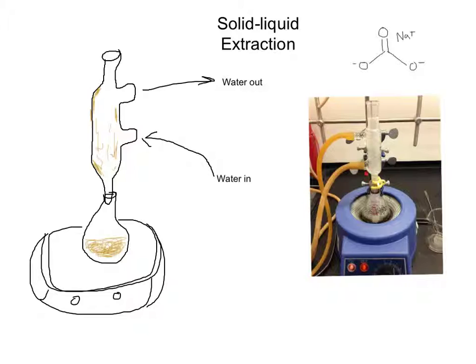After the solution of water and sodium carbonate was added to the tea leaves, the complete solution was heated, which allowed the water to expand the leaves, dissolving caffeine in water along with other impurities.